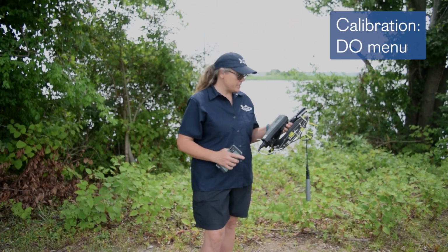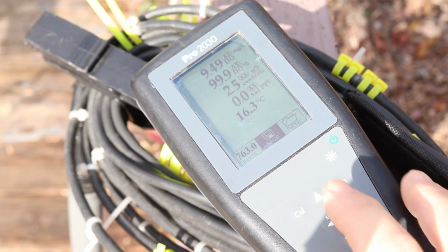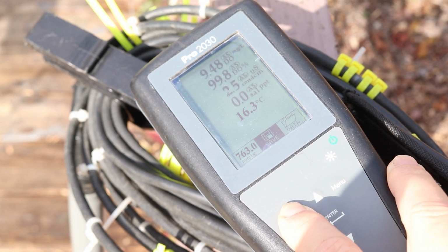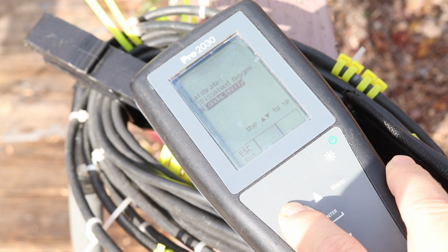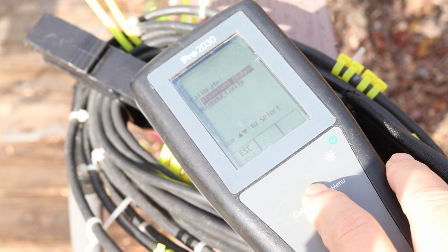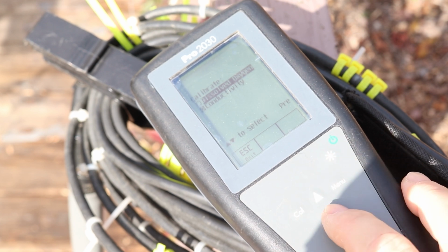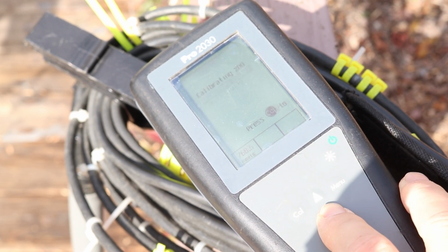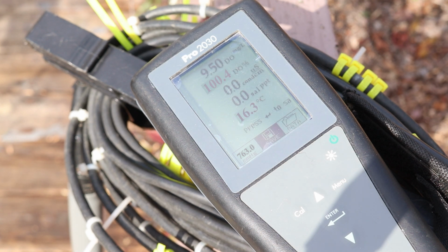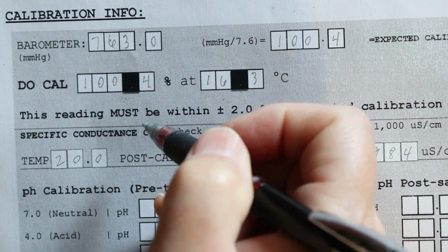So at this point, we're ready to calibrate. We're going to do a long press on the cal button again, and we'll see the same menu that we saw back at home when we calibrated conductivity. We're going to use the arrow button to move up to dissolved oxygen and press enter. Unlike our conductivity calibration, DO is immediately going to begin calibrating. And hopefully it'll say calibration successful. This meter did. Our DO percentage is at 100.4, so we are dead on, a perfect match to our expected calibration value.